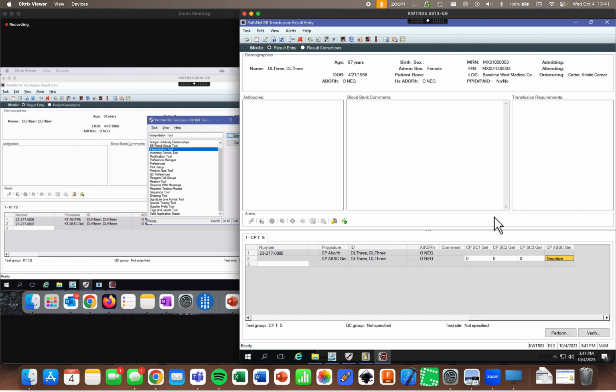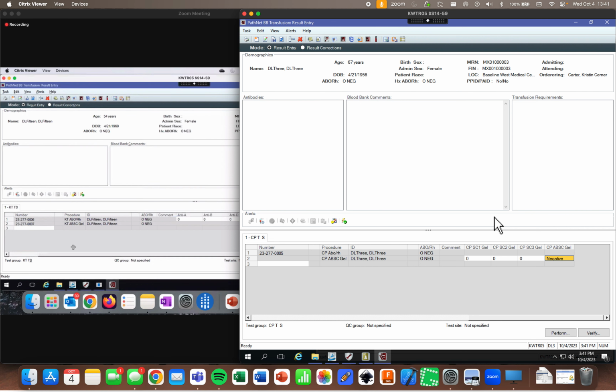Well, it already auto-populated. Yay! That's your system generated at work. Oh, okay. You got it. Awesome. And then I need an ABS-C. So this one we'll just go ahead and make that one positive.